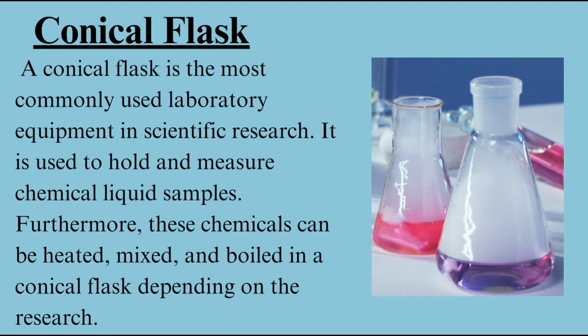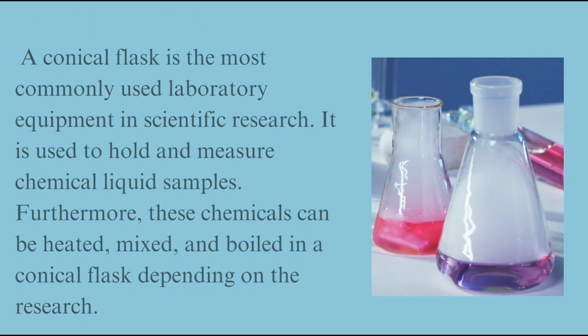Conical flask. A conical flask is the most commonly used laboratory equipment in scientific research. It is used to hold and measure chemical liquid samples. Furthermore, these chemicals can be heated, mixed, and boiled in a conical flask depending on the research.